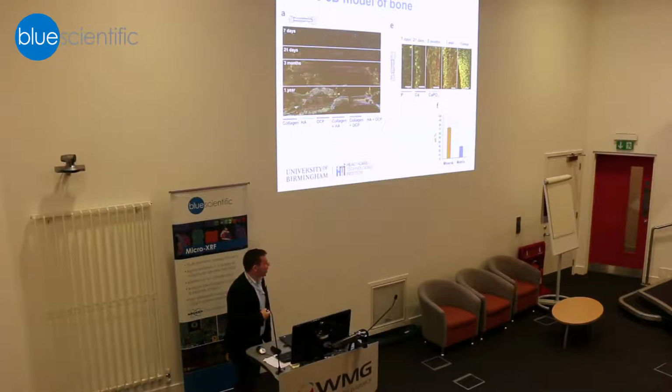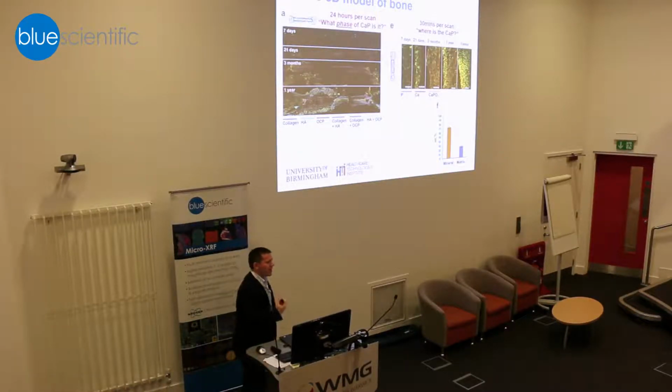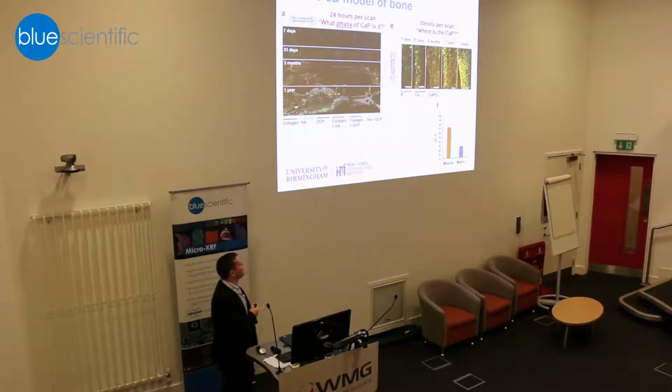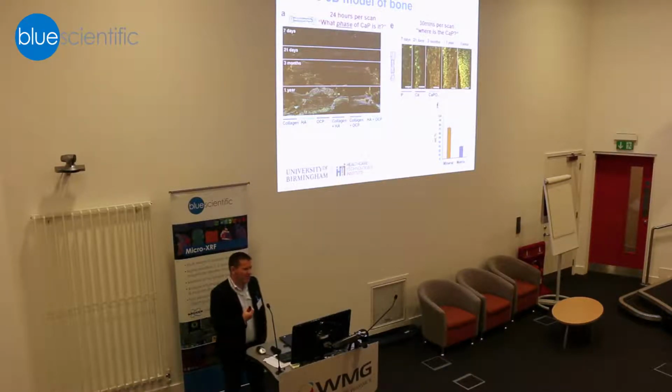From the XRF map, we can quantify the level of bone mineral in a non-destructive manner, and we can monitor this over time. But the key for us then, why XRF? If we could look at bone mineral and look at different phases from the start with Raman, why are we even bothering to use XRF in the first place? The key for us is that although Raman is non-destructive, technically, because we're looking at such low concentrations of mineral embedded in a really thick, highly fluorescent matrix full of proteins, it's really difficult to get a good signal-to-noise ratio.